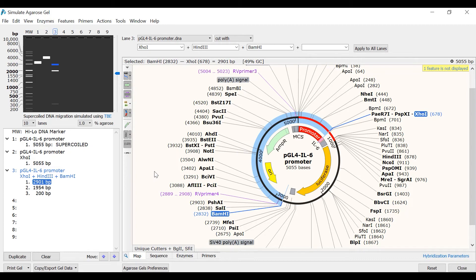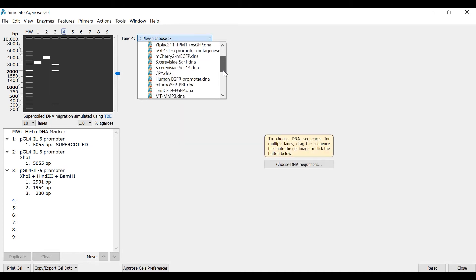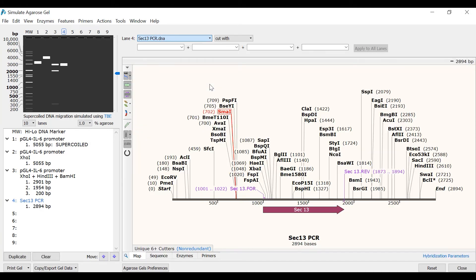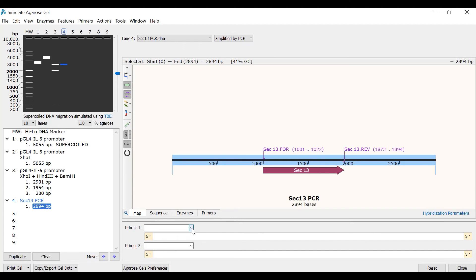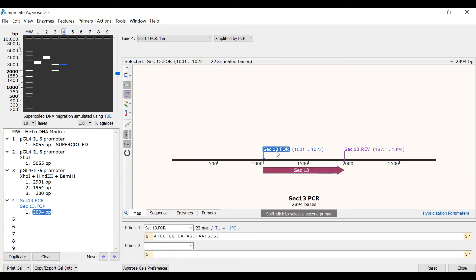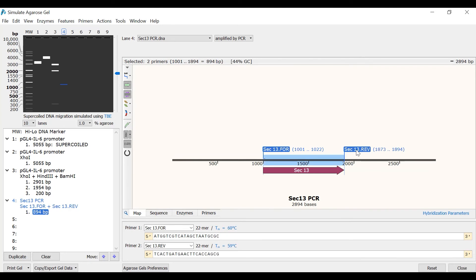Next, I will show you how to visualise products following PCR amplification. I will select lane 4 and open a file called Sec13PCR. This file contains the sequence of the Saccharomyces Sec13 gene, with some flanking sequence either side of the feature. There are 2 PCR primers designed to anneal to the start and end of the Sec13 gene. I will change the dropdown menu at the top to Amplified by PCR, then use the dropdown menus to specify the 2 primers, or shift-click them in the map view. The amplified product of 894 base pairs can now be viewed on the simulated gel.